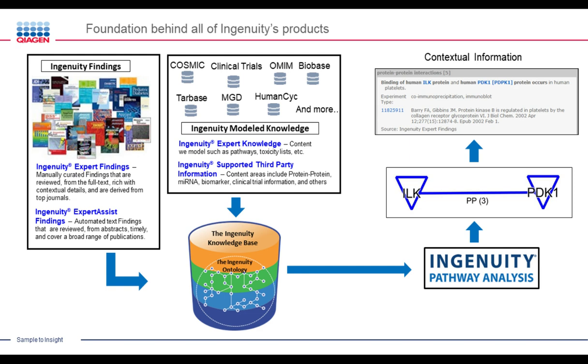So all in all, our curators keep this database as up-to-date as possible, so you get as up-to-date an analysis as possible. Now, keep in mind, we mainly curate information from human, mouse, and rat, but that said, if you're working with other species like bovine, chicken, or chimpanzee, you can still use IPA. As a matter of fact, if you go to scholar.google.com and search for IPA with these other species, you'll find plenty of publications.